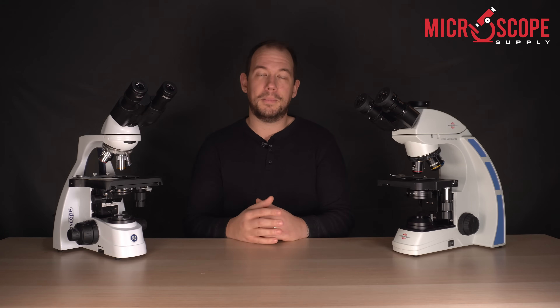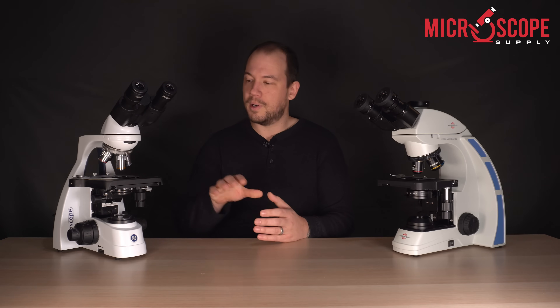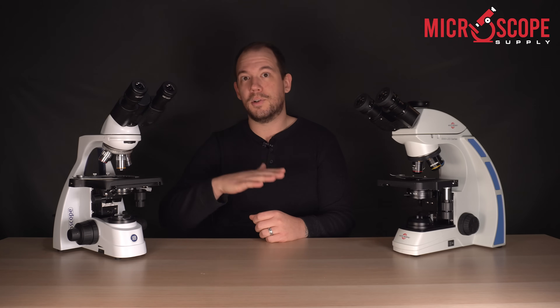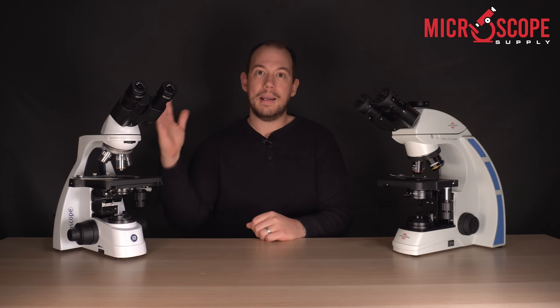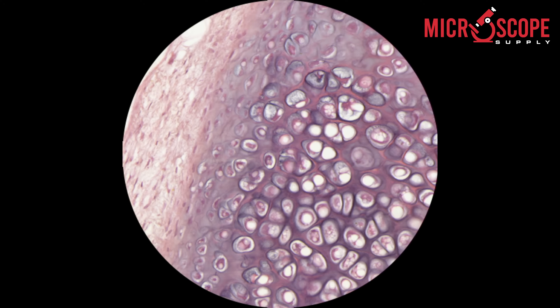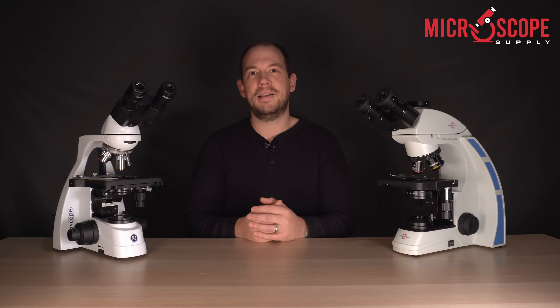With halogen bulbs you do have to replace them every couple thousand hours. There's another thing to notice when purchasing a halogen-illuminated microscope: the color temperature will vary between the lowest and highest intensity. As you increase the intensity on a halogen microscope, you'll notice the color temperature go from a warm yellow up to a cool blue, which can be difficult to manage — especially if you're using a camera to capture images, since you'll constantly have to do a white balance. So I think LED is the way to go.